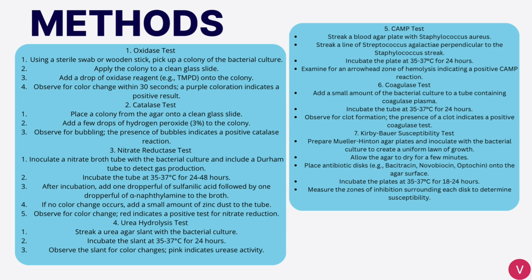For our catalase test, we placed the colony from the agar onto a clean glass slide. We added a few drops of the 3% hydrogen peroxide to the colony. We then observed for bubbling, so the presence of bubbling indicates a positive catalase reaction.